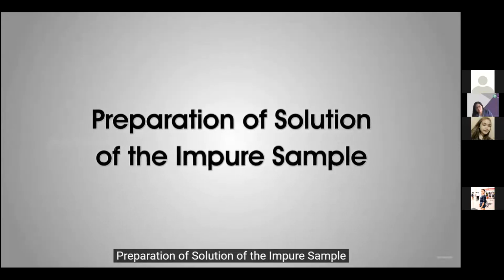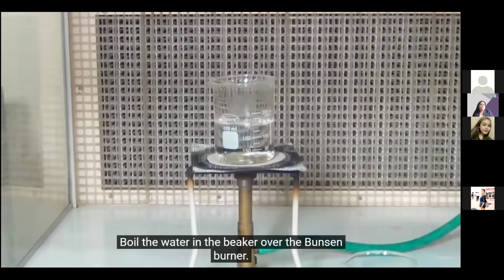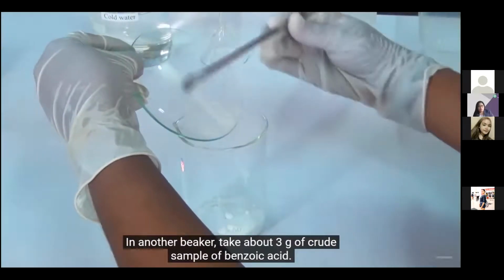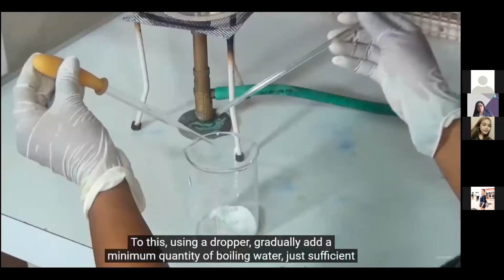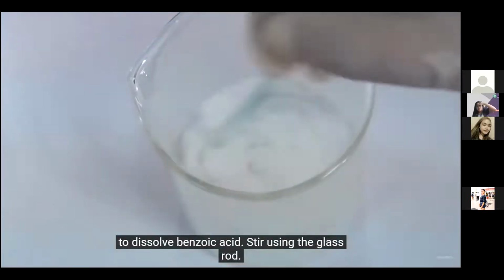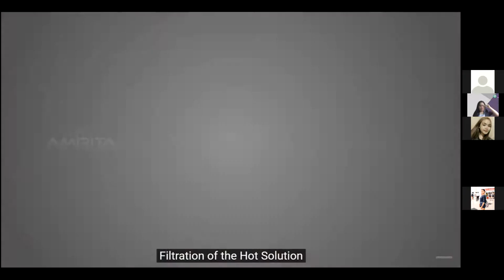Preparation of solution of the impure sample. Take about 150 ml of distilled water in a beaker. Boil the water in the beaker over the Bunsen burner. In another beaker, take about 3 grams of crude sample of benzoic acid. To this, using a dropper, gradually add a minimum quantity of boiling water, just sufficient to dissolve benzoic acid. Stir using the glass rod. If required, heating can be done to dissolve benzoic acid.